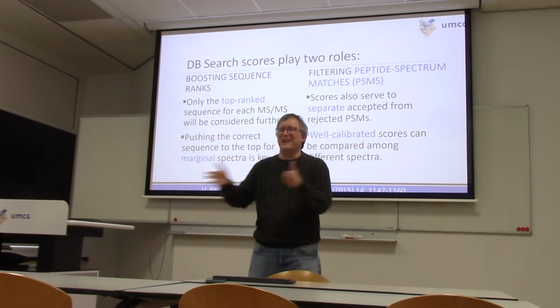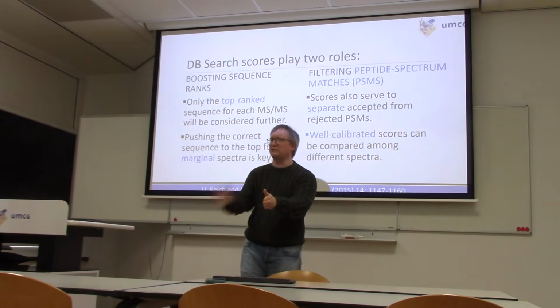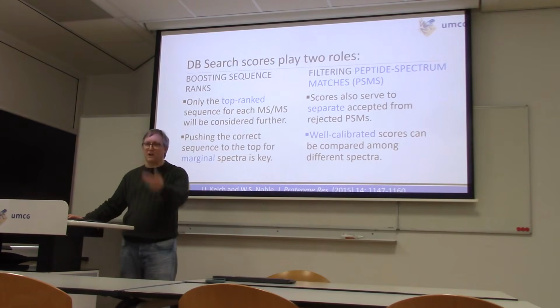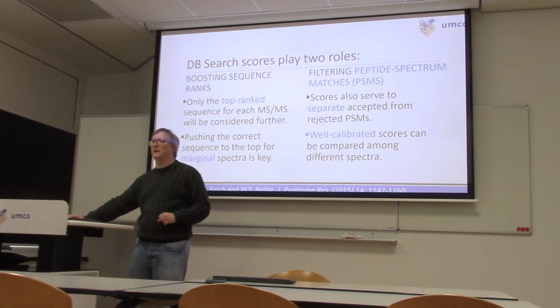So how do you deal with a length dependence in trying to use this score to separate the good stuff from the bad? Being able to calibrate scores so that they're able to be used to threshold across spectra on an even-Steven basis is really important and valuable.